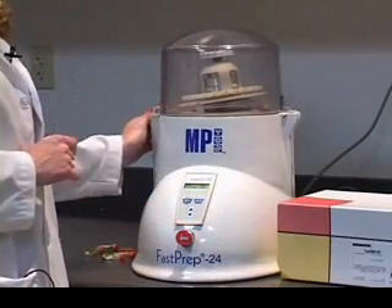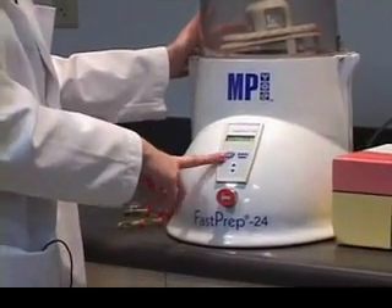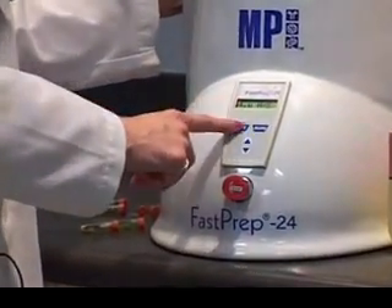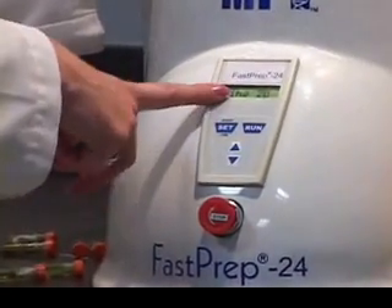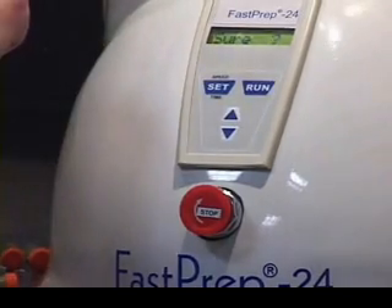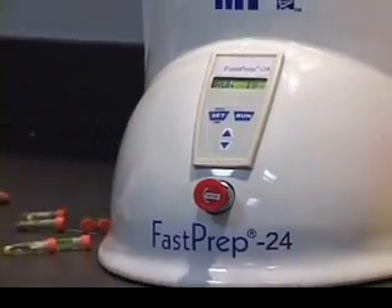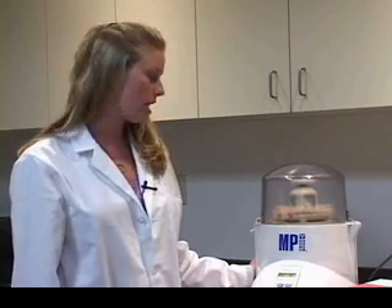If you open the top at any time, it's going to immediately shut off. I'm going to run my sample at 4 meters per second and 20 seconds — all I do is hit run. It asks if I'm sure — it's a safety feature. Yes. You can see it's very quiet. When the samples are done being lysed, they're ready to put into the centrifuge. You spin the debris down and then use the clear supernatant on top to run RNA, DNA, or protein isolation with the kits.